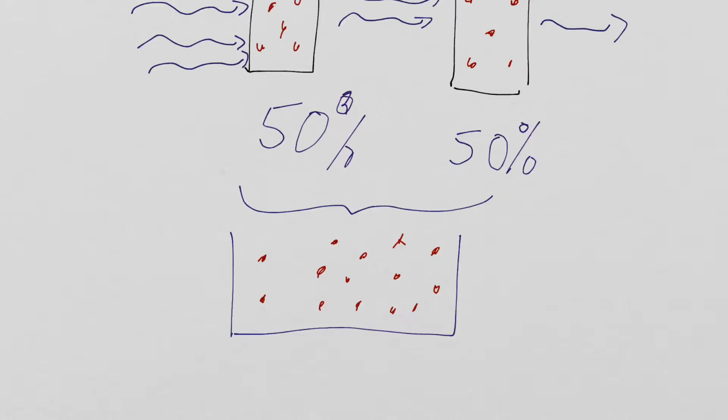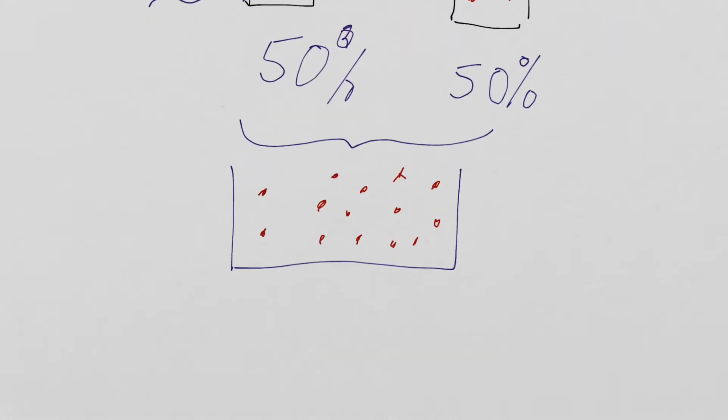So what we can write in the first place is our absorbance, how much of the light is getting absorbed, depends on the thickness of our container. How big is this container? We abbreviate that with D. This is the thickness of the container, and very often it is, or usually it is 1 centimeter.